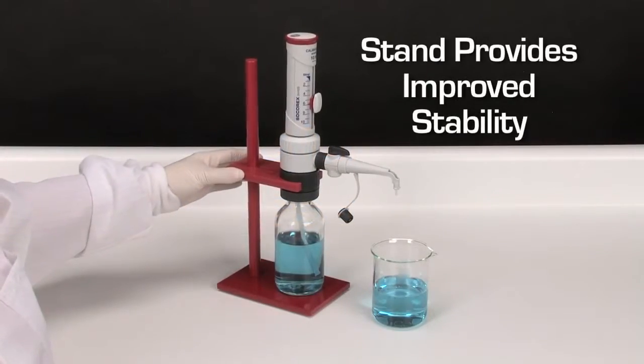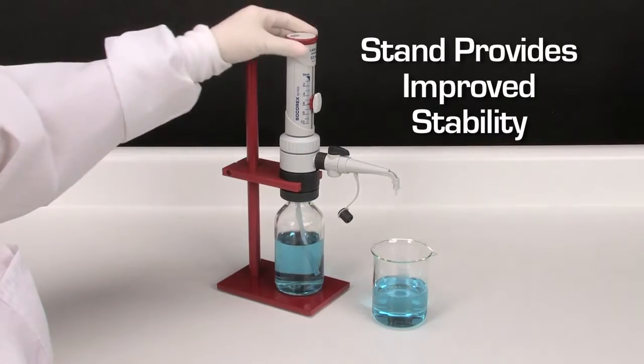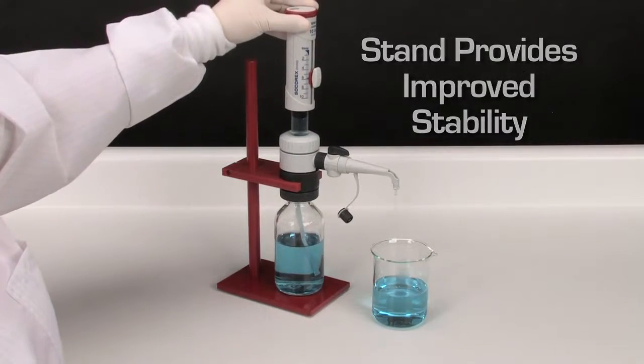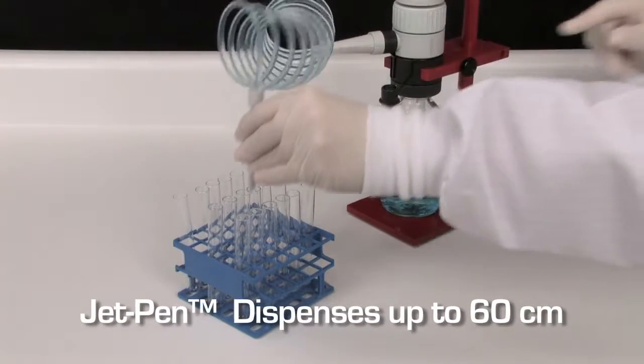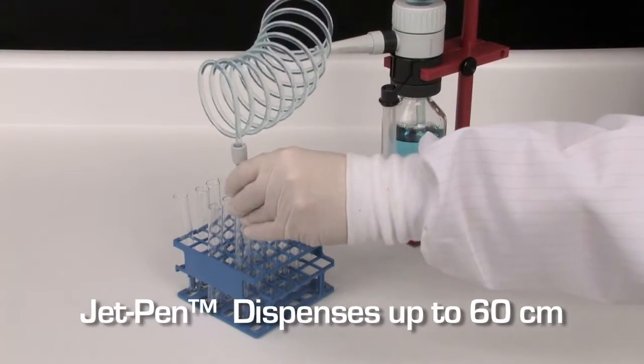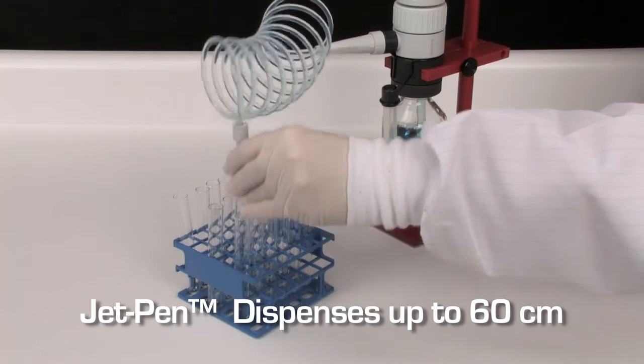The specially designed stand holds a dispenser when the dispenser is attached to a small bottle. Spiral tubing and the delivery jet pen help dispense material into vessels with maximum comfort within a 60 cm distance.